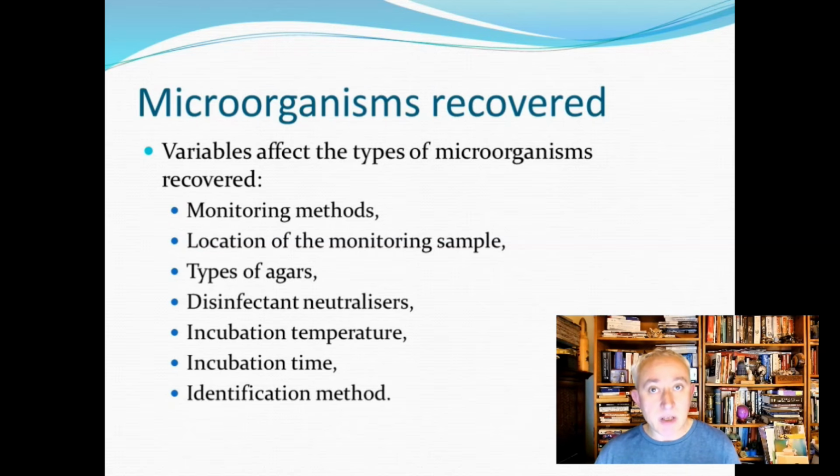So it could be in a state of non-culturability, which could be something that is transient, like a stressor has rendered an organism that's normally culturable no longer culturable, or it could be simply that there's yet to be a culture medium against which this organism can grow. So the types of agars are influential, but so is the location of the monitoring sample, and picking the right location matters, and also our sample sizes are going to be relatively small.